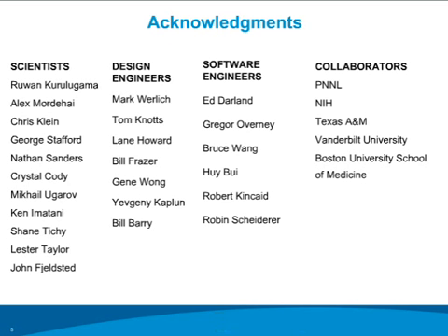Dave Russell at Texas A&M is excited about the ability to use mobility separation to further his developments at his laboratory. And I'm also delighted, as already mentioned, that John McLean will be talking from Vanderbilt, and he'll be showing some of his most recent results using ion mobility separation. Finally, we've been working closely with Kathy Costello at Boston University School of Medicine to see how mobility separation coupled with mass spectrometry helps her in her research into complex biological systems.